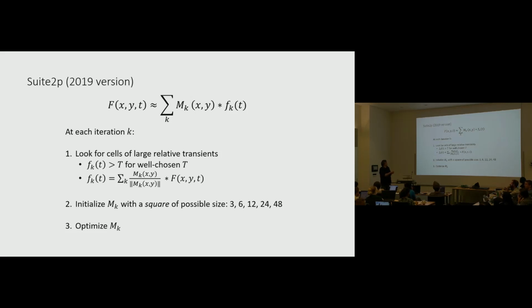So we keep one fixed, and then to determine the other one is just a linear regression, because we know F. This is our movie. So if we're trying to match the right-hand side to the left-hand side, we keep M fixed, and finding F is just linear regression. Now we can switch over, keep F fixed, and determine M given F. And it's also linear regression, just on the other set of variables. If you keep iterating this over and over again, you arrive at the best fit for this one new cell that's our one new candidate to be added to our set of active cells.